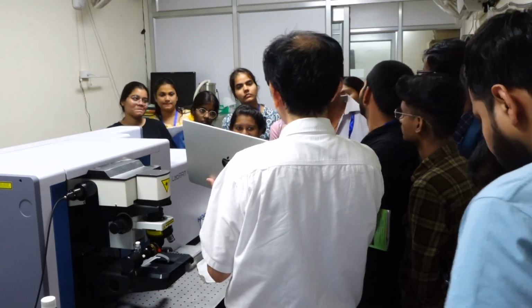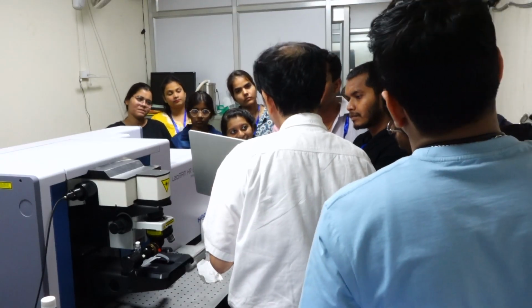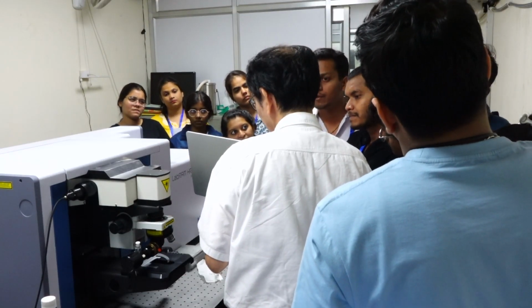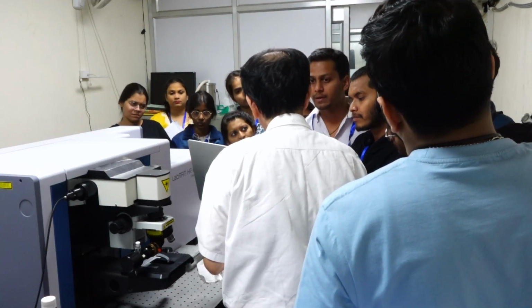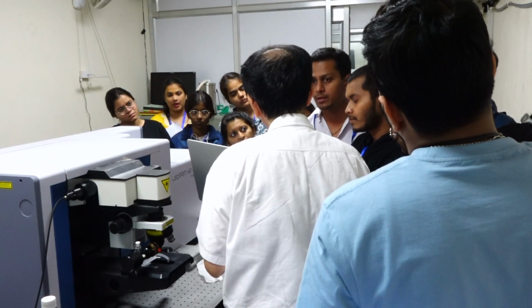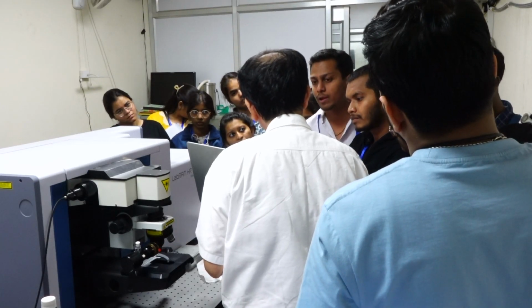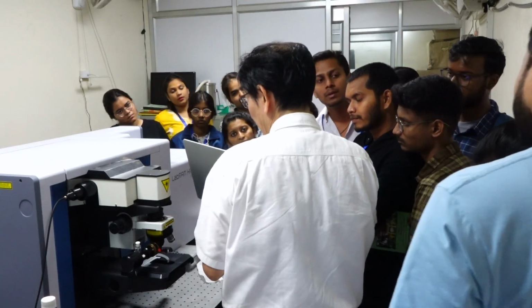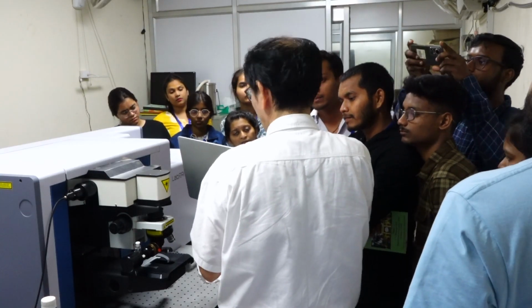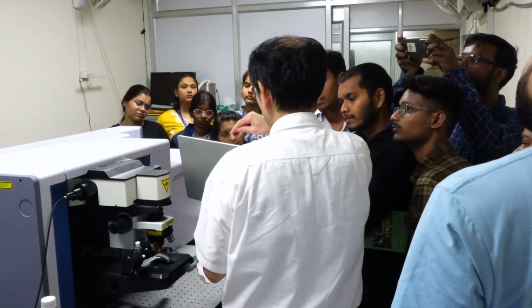One more thing: when we want to take Raman imaging spectra, how can this be achieved? If we want to see the APIs in a tablet, how can we see them? If you do imaging, you can gather this kind of data at each position.